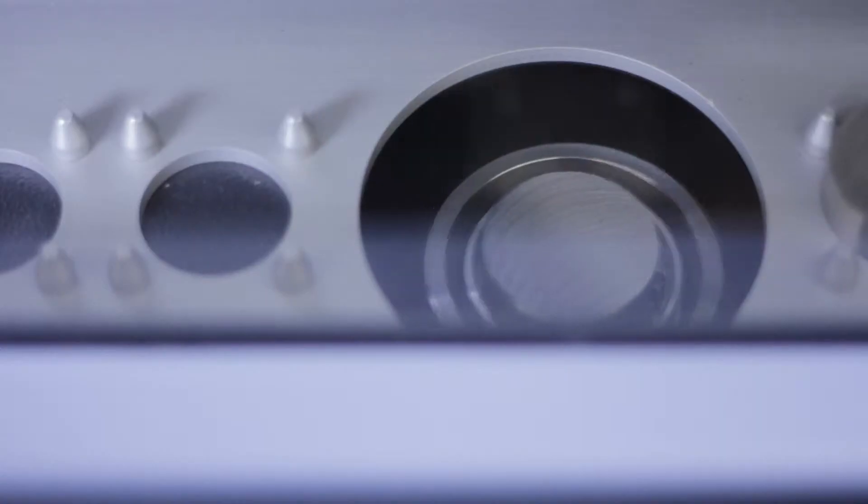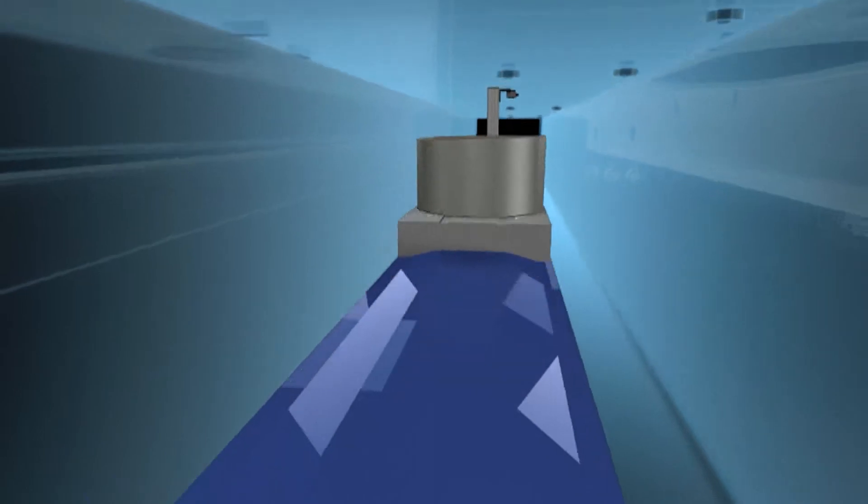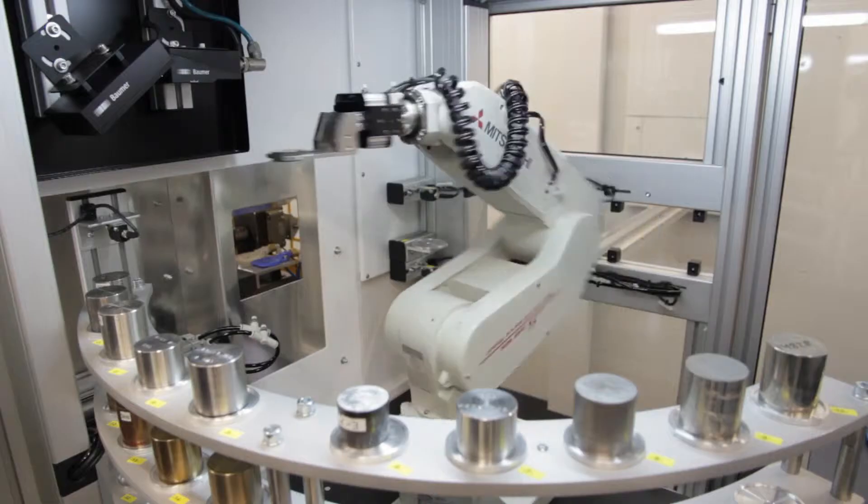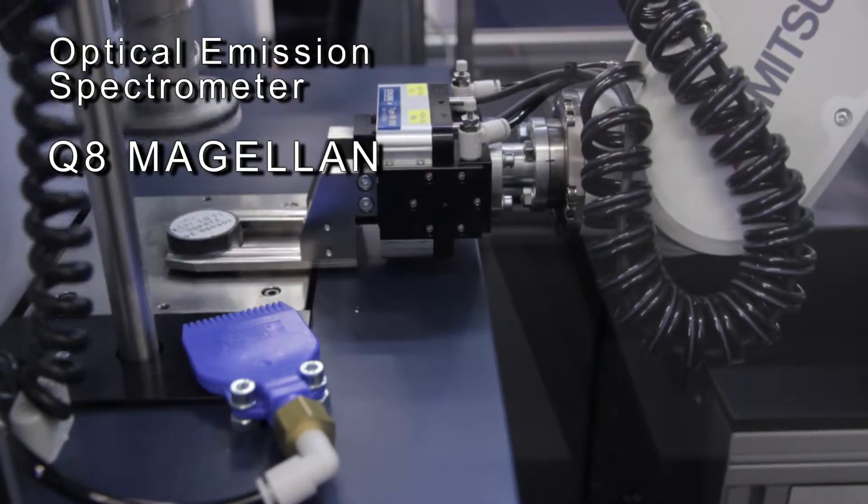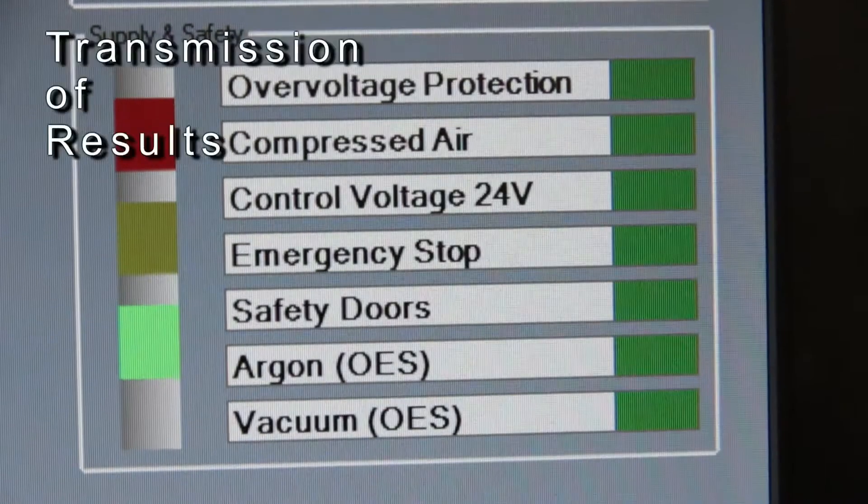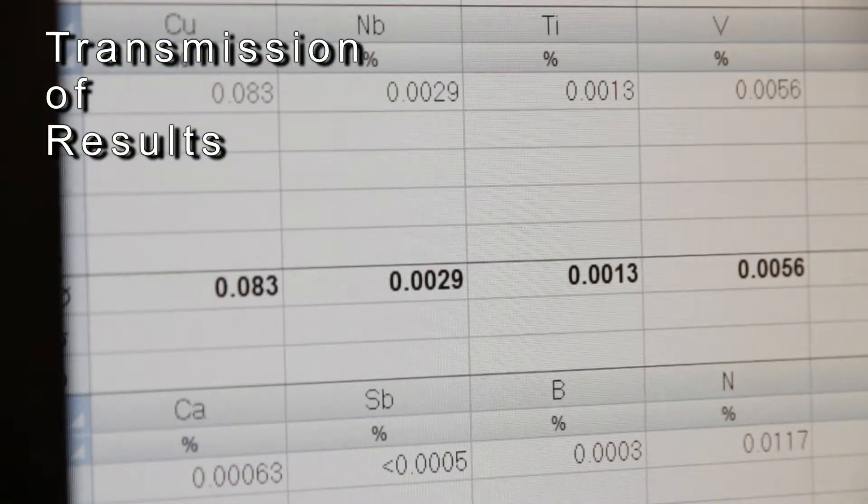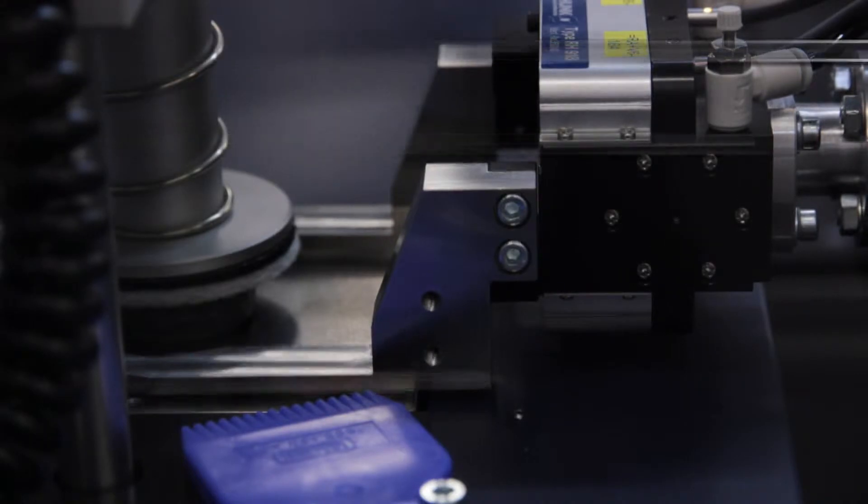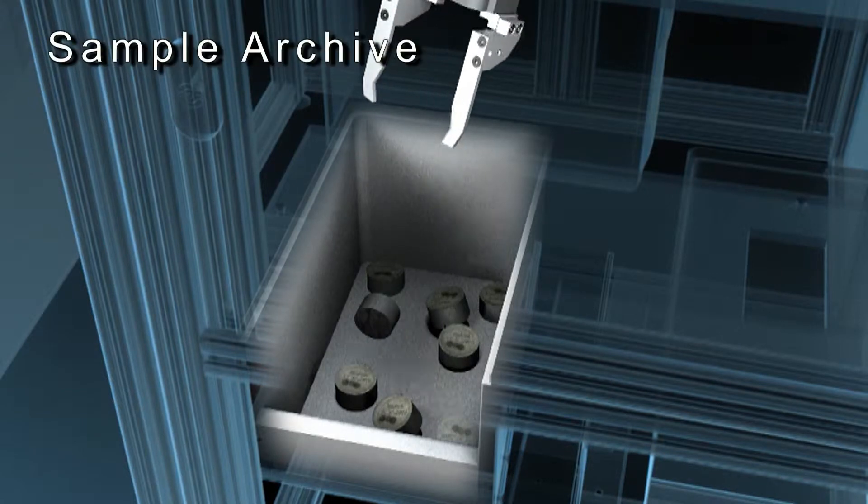The analysis results are sent to process control systems or output devices. Measured samples are dropped into archive boxes.